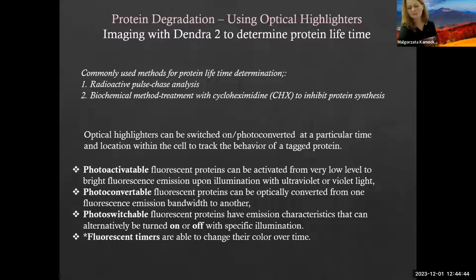All right, so let me switch to protein degradation. Talking about protein degradation gives me an opportunity to mention optical highlighters. I really didn't see much interest in optical highlighters in our facility, and it's very surprising.